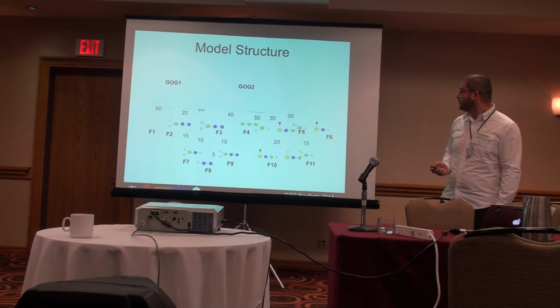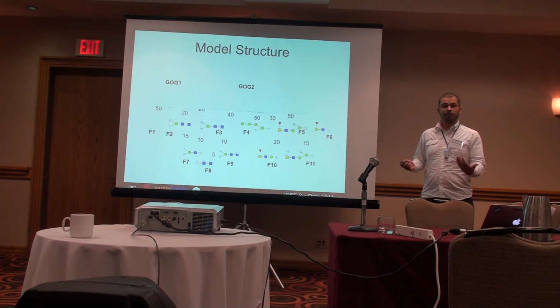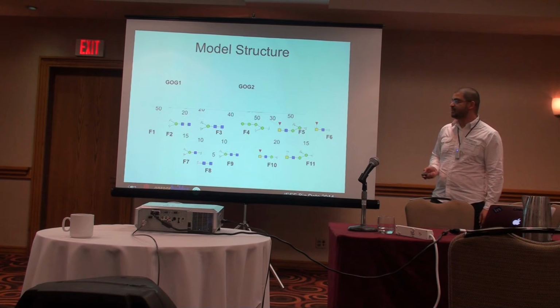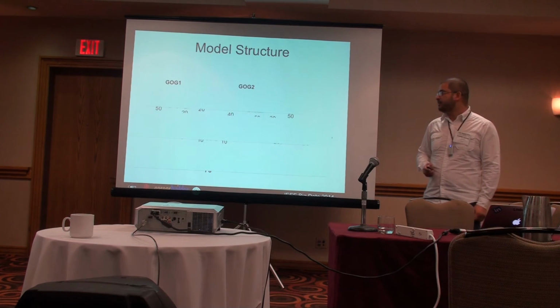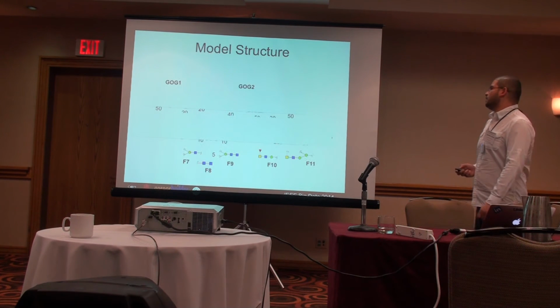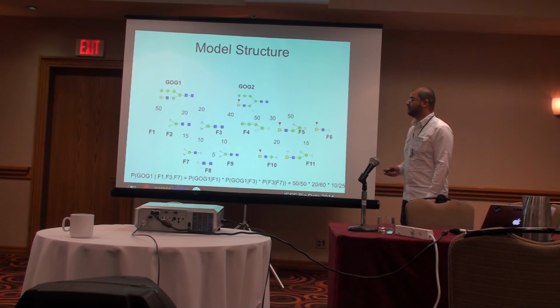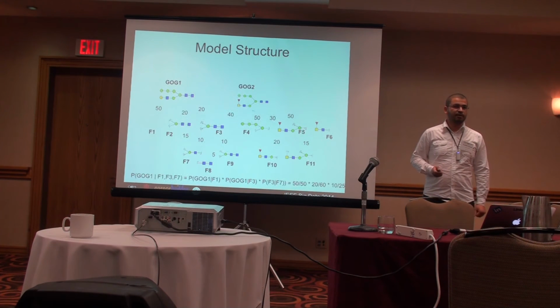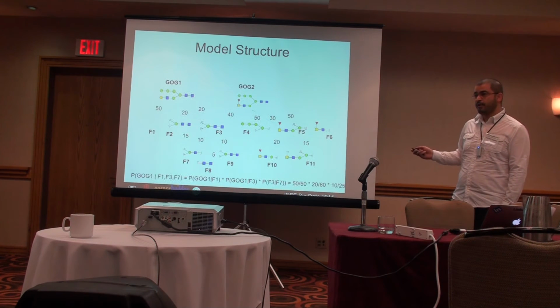So as a Bayesian network, if you want to think of it, the first level is the node for MS1, the second level is the node for MS2, and the third level is the node for MS3. So how do we then do the probabilistic calculation? Well, we use this model actually for the auto annotation.